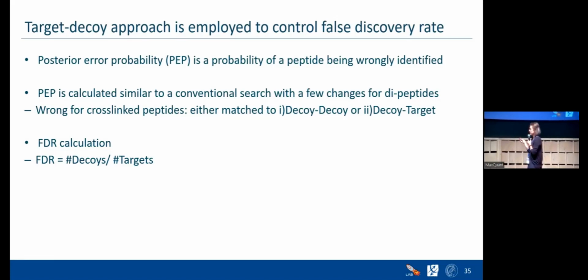For crosslinking, we adapted this to our case because we don't have one peptide, but two peptides. So which miscleavages are we going to take? Or are we going to take the Andromeda score? We adopted this PEP calculation, and I did some tests. It works now.